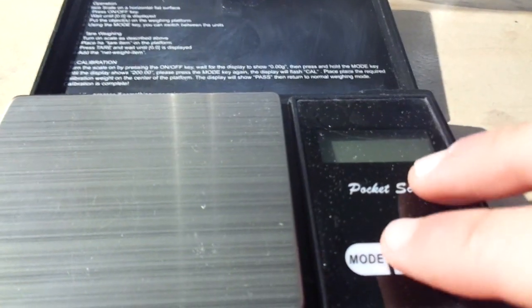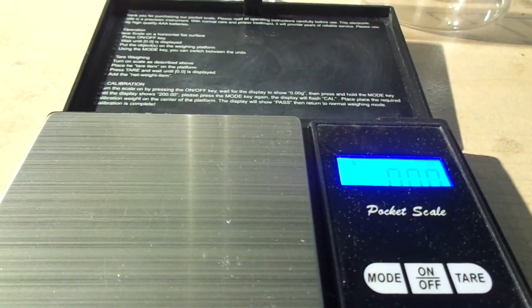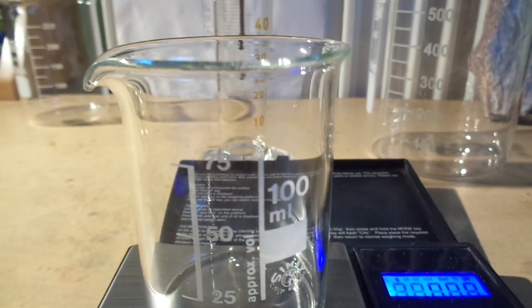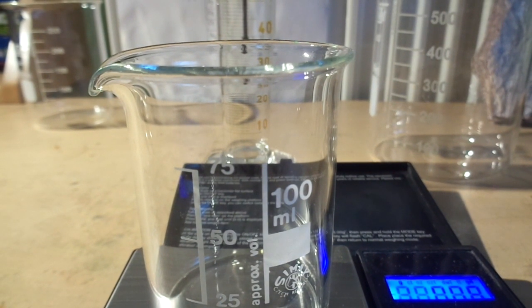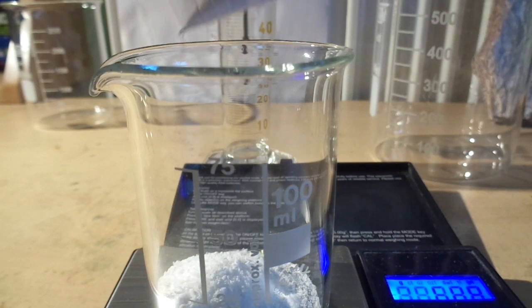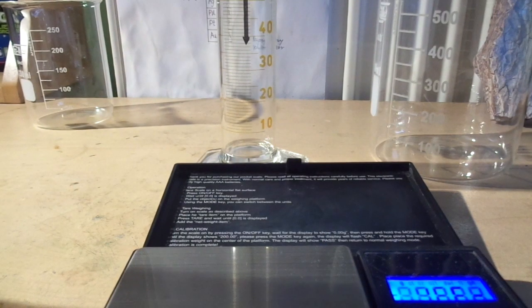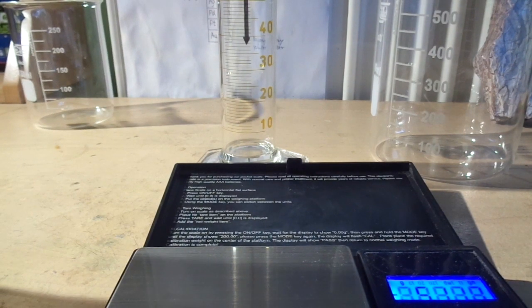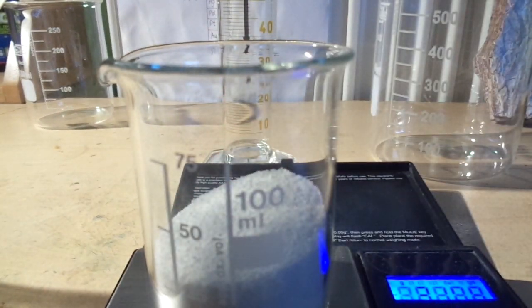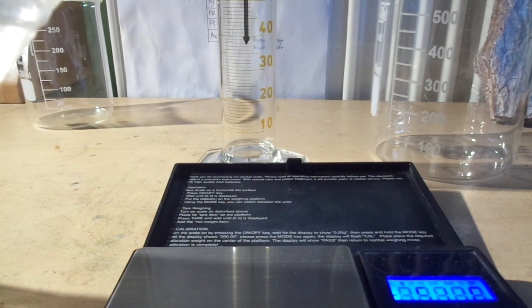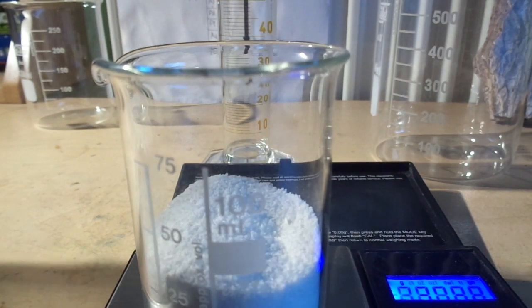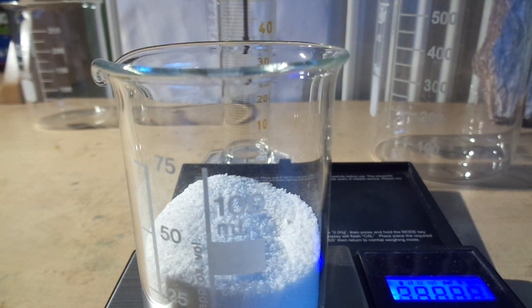Scale. So, 13 grams. Okay, that's a little bit too much. Okay, just a little bit of an excess, but that's not a problem.